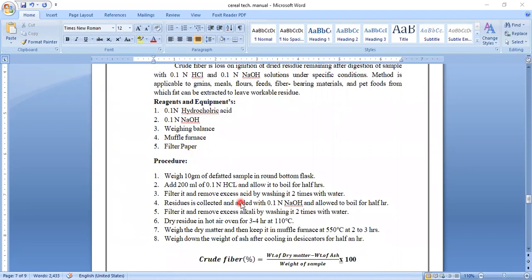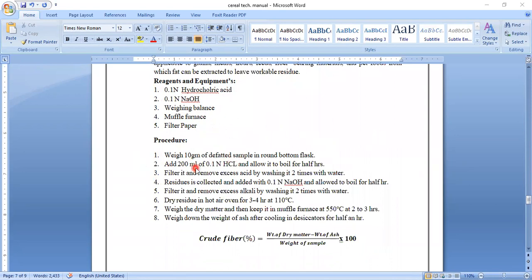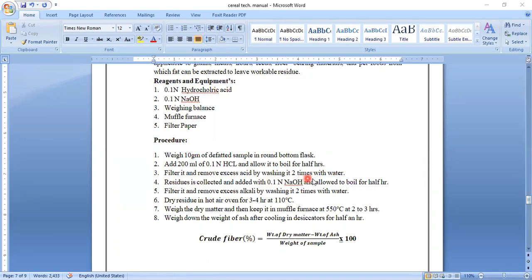The procedure to find out crude fiber content: first, weigh 10 grams of the de-fatted sample — that is a food product from which fat has been extracted and the amount of fat content is less. Take that weighed sample in a round bottom flask, then add 200 ml of 0.1 normal HCl and allow it to boil for half an hour. Then after boiling, filter it and remove the excess acid by washing it two times with water.